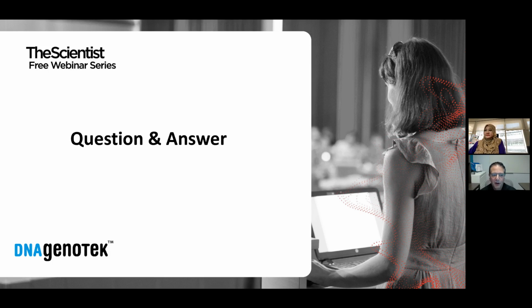So it's a very long time at room temperature. And for OraCollect, which is the saliva swab type device, you'll get at least 60 days of stability out of it. We have found that it usually lasts longer than 60 days, but our official claim is 60 days. Perfect. Thank you.